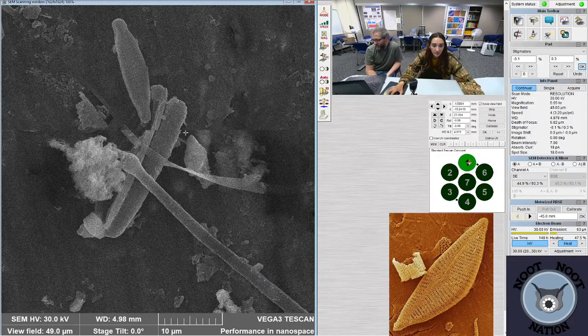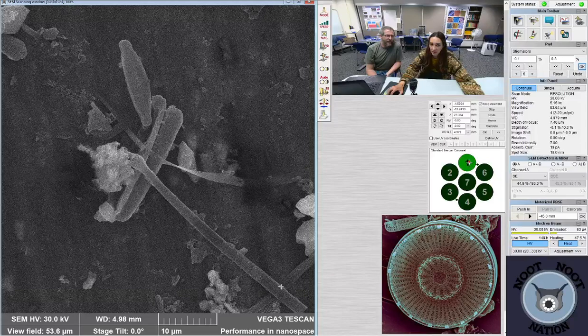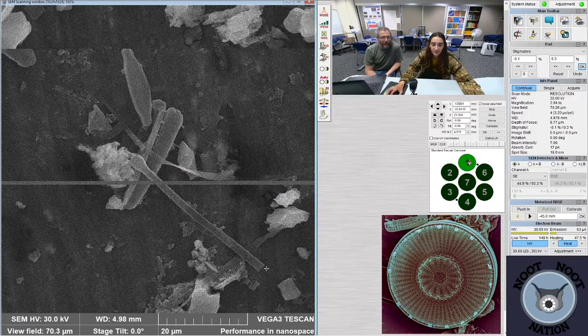This one, is it another tabularia, or is it the same? Oh, that could be fragilaria pinnata. I don't know, it's broken? Yes. So, who knows what could happen on the other side of that? Yeah, it's the vacuum pump.